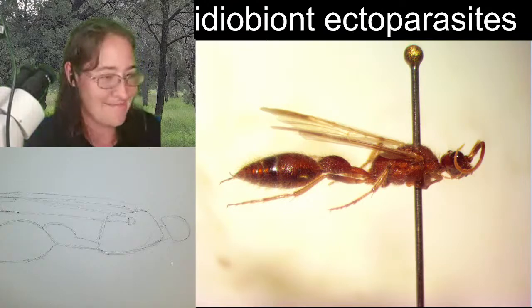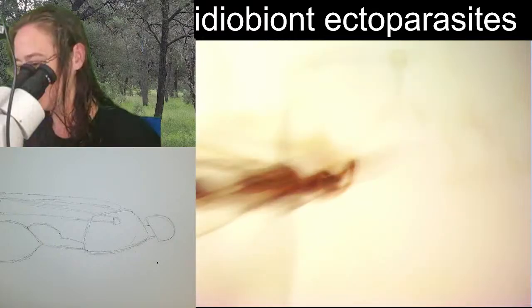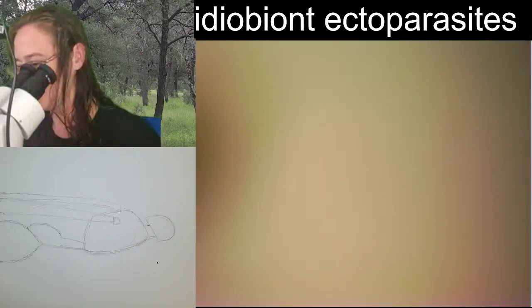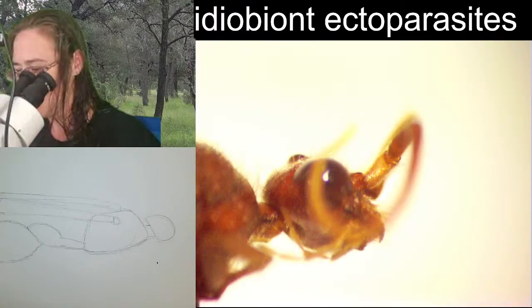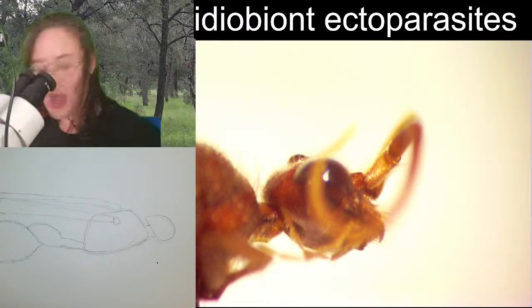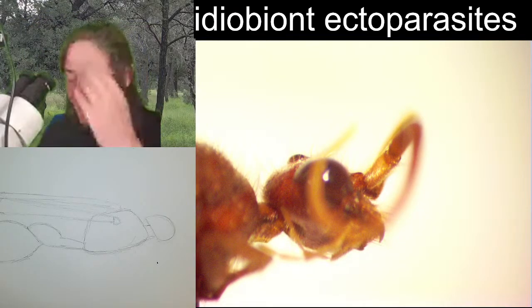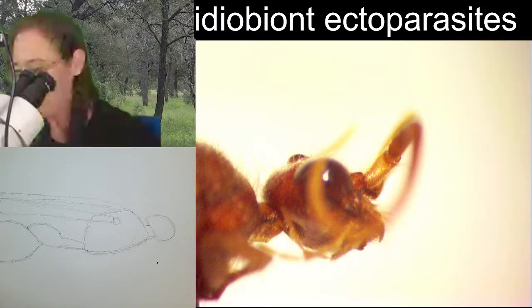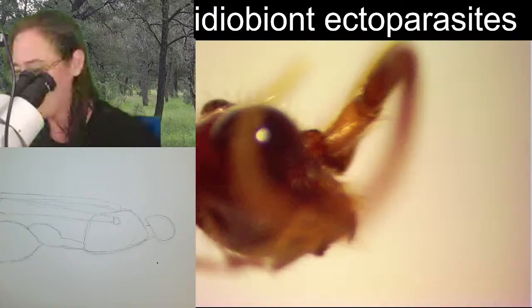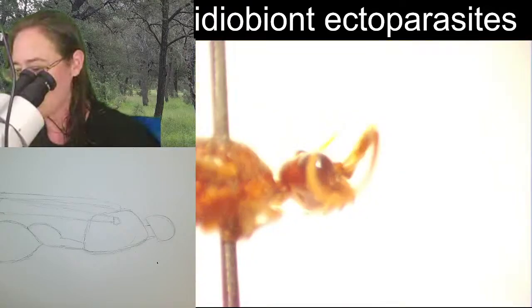All right, let's see. Let's zoom in on the head. Now, the only thing that we miss from a lateral point of view are the really cool ocelli that this velvet ant has. This velvet ant has three ocelli. Look at that. What?